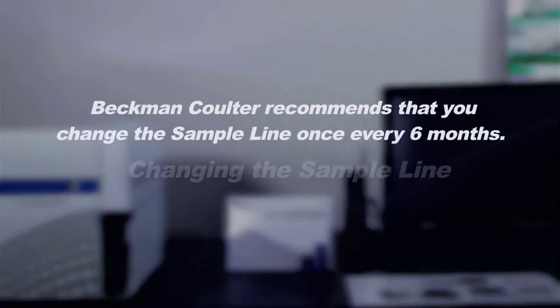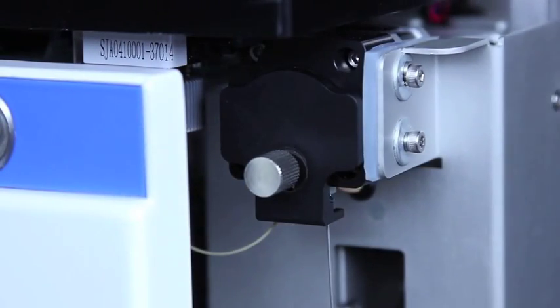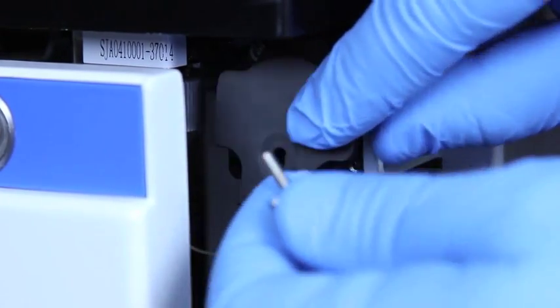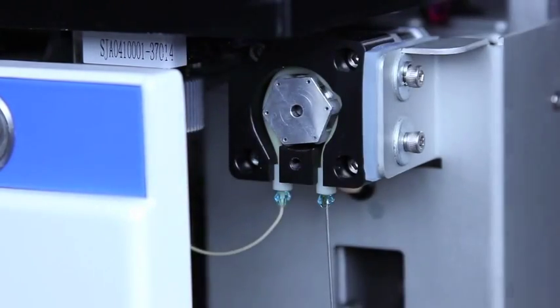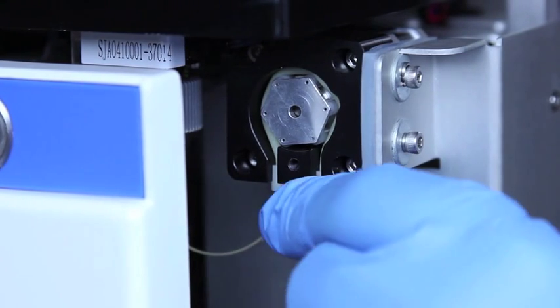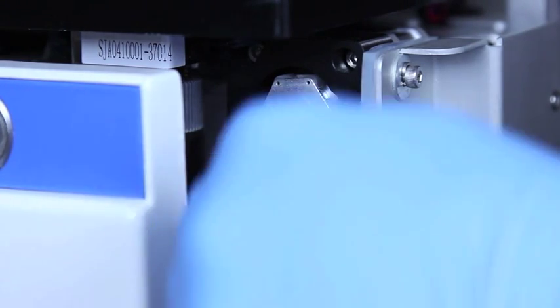Beckman-Coulter recommends that you change the sample line once every six months. To remove the old sample tubing, first remove the thumb screws that hold the sample peristaltic pump cover. To replace the sample tubing, simply remove the tubing by pulling the stoppers and the tubing out of the peristaltic pump and disconnect the sample line.